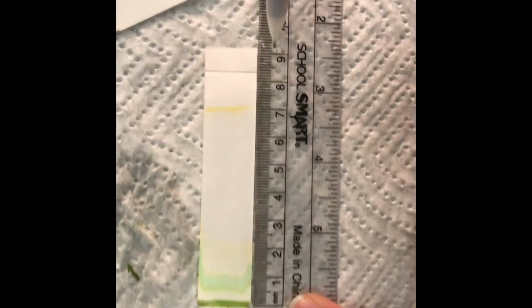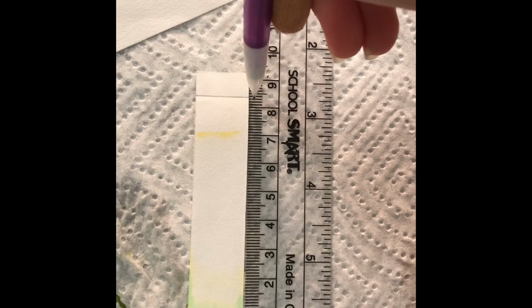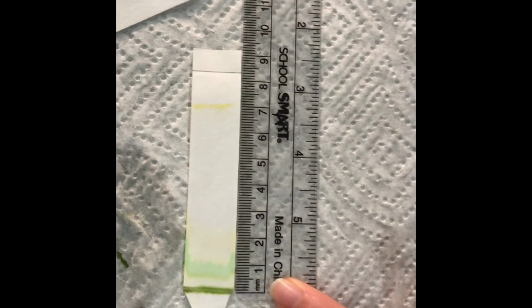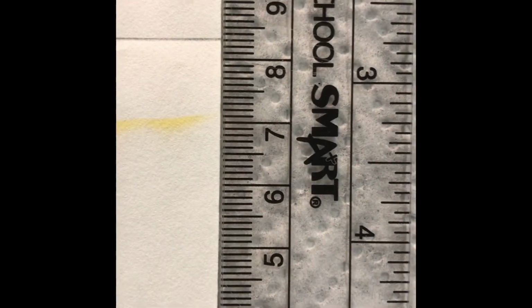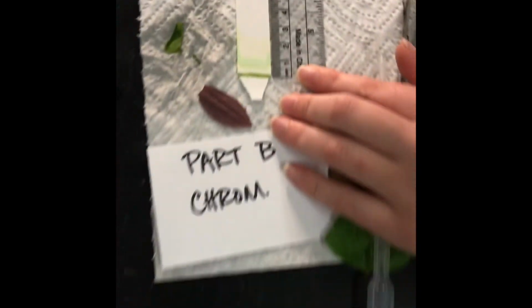What do you calculate? So like 8.5. Okay, so that's centimeters, so we're going to go 85. Is that about right? What do y'all think, virtual kids? I say 81, 2, 3. I say 83. Okay, millimeters, so we can record that somewhere. Just write that down. So that's the distance from the origin to the solvent line.